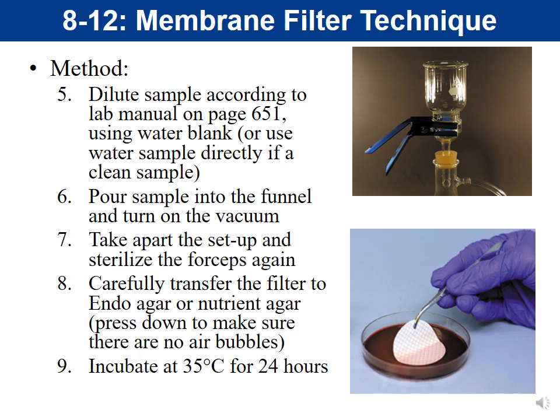If I was testing a water sample, let's say that had fecal matter contamination, like we knew that there was a problem with sewage spilling into the water, and I was wanting to test that water, well, then I'm not going to want to use the water straight up. I would want to dilute it first so that I don't get too much bacteria on the grid. So I'll cover that in a minute in terms of the amount of water to use.